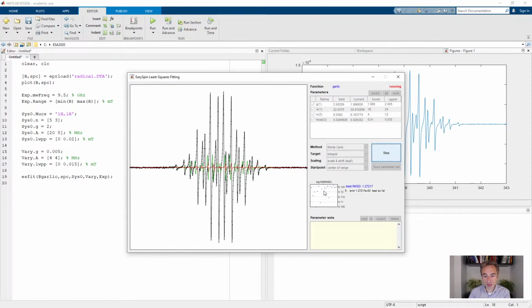And now you can see in the root mean square deviation plot that there is no systematic lowering happening, because this algorithm doesn't systematically walk down to a local minimum on the error surface. It just randomly looks at random points. It's like somebody flying all over the Earth to find the global minimum. And as you can see, it's making very little progress. This is very challenging because the algorithm doesn't use any information from the error surface to find a minimum. It just hops around like crazy. Sometimes it's lucky and it finds a reasonable fit, but in general, Monte Carlo is not very effective.